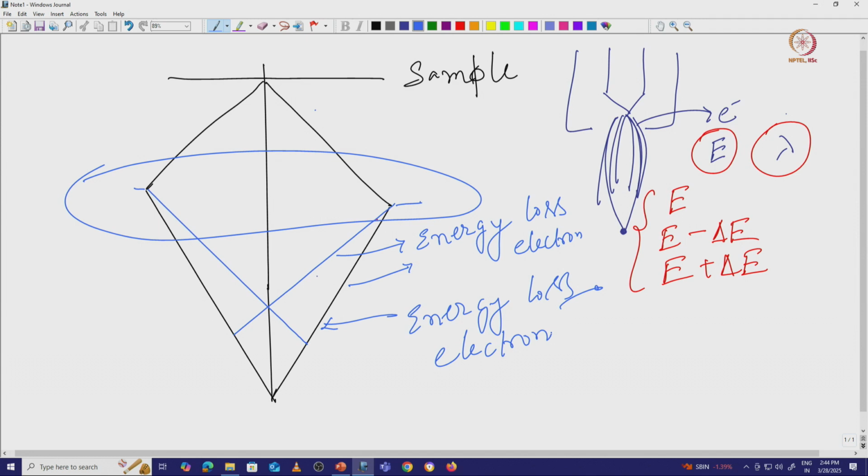Okay, so here you can see that this angle is very important, because this is the angle which is called beta. And here, this is the image plane where we can get the actual image. This is the actual image plane.